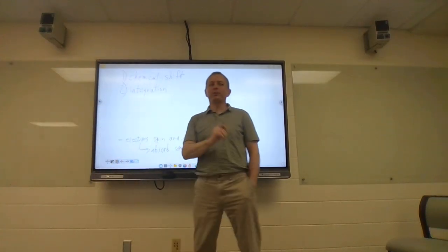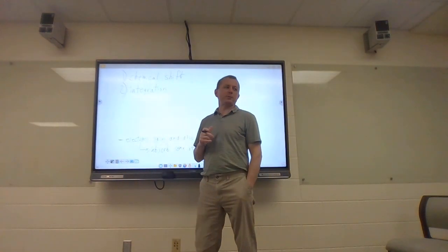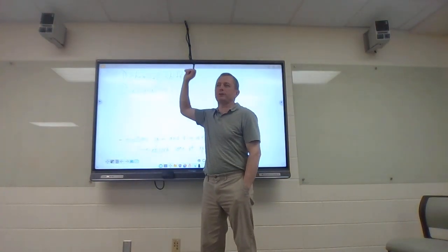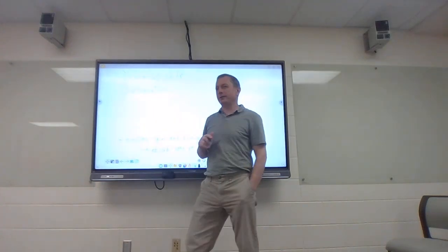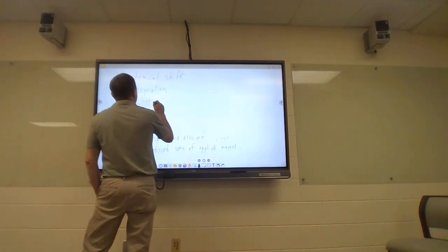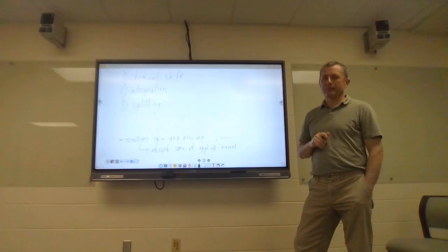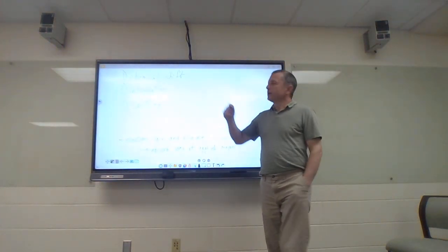And I'm going to tell you preemptively, there's a large portion of spectra that can be easily determined from just the chemical shift and the integration. I say that because most of you are going to fear the third one the most, and that is called splitting. Okay? Let's now look at each of these separately.